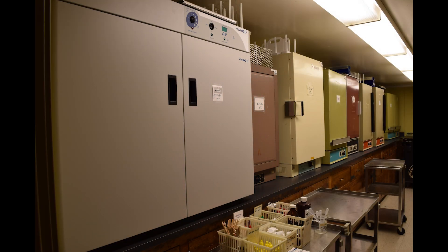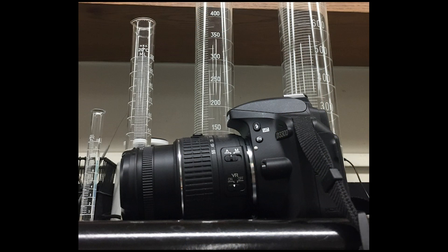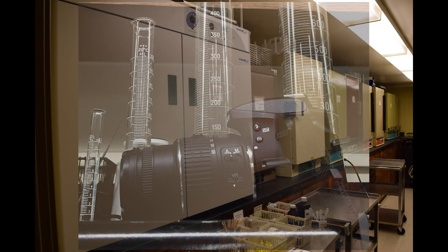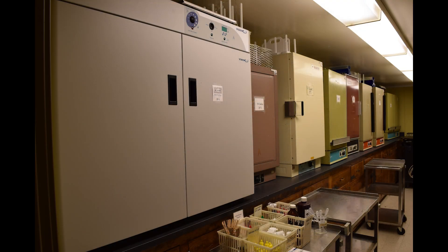One, incubators which are used to grow bacteria are warm. The warm temperatures help bacteria grow faster, but it's not good for my DSLR camera and I don't want to damage it. Two, the incubators in my lab have no lights. So it is dark in a closed incubator. This means my cameras can't see anything.